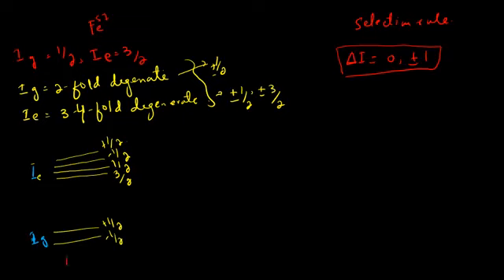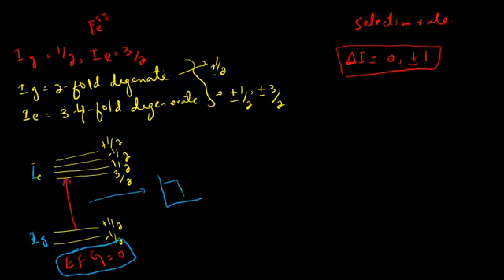So when the electric field gradient is equal to 0, only one transition is possible between the excited state and ground state of the nuclear energy levels. So in the corresponding Mossbauer spectrum, we observe only one signal. The Mossbauer spectrum will be like this one.